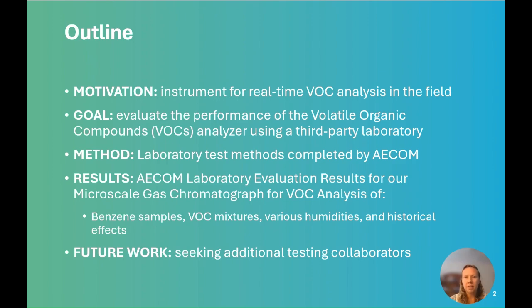I'll share the methods that were used to test the analyzer, and then I'll share a selection of the results from this testing, including some various benzene sample tests, mixtures of VOCs, various humidities, and a brief look at historical data. Finally, I'll summarize the work here and highlight some future tests and collaborations that we're seeking.